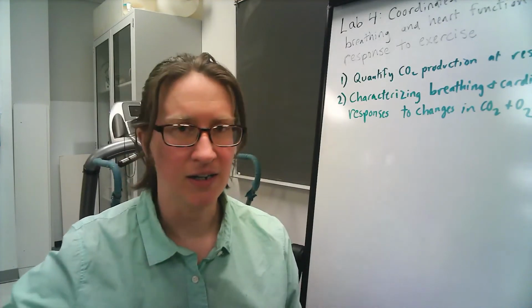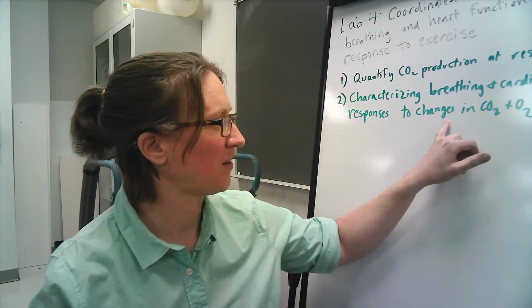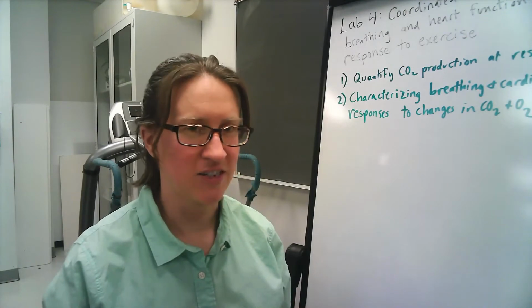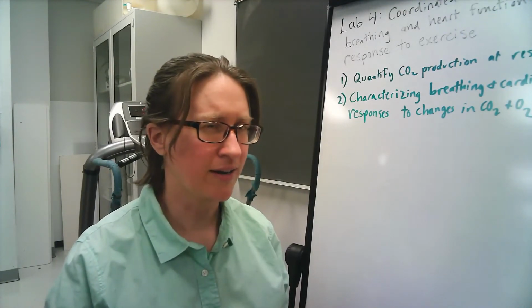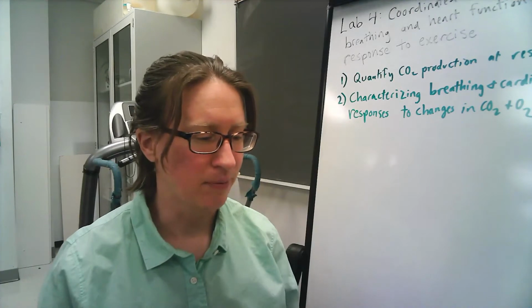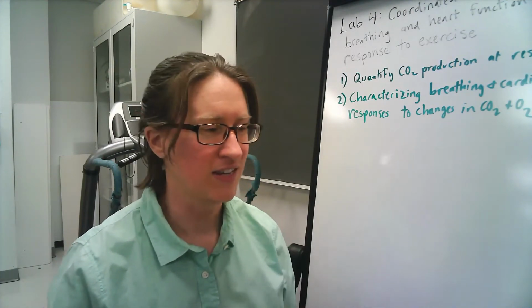The next part of this exercise, so then we've got these changes in carbon dioxide and oxygen here, is, okay, well, how do we examine responses to changes in CO2 and O2? And for this, we're not going to do the same thing we did with the reptiles 2 weeks ago, where we blew elevated CO2 in front of the reptiles' faces.